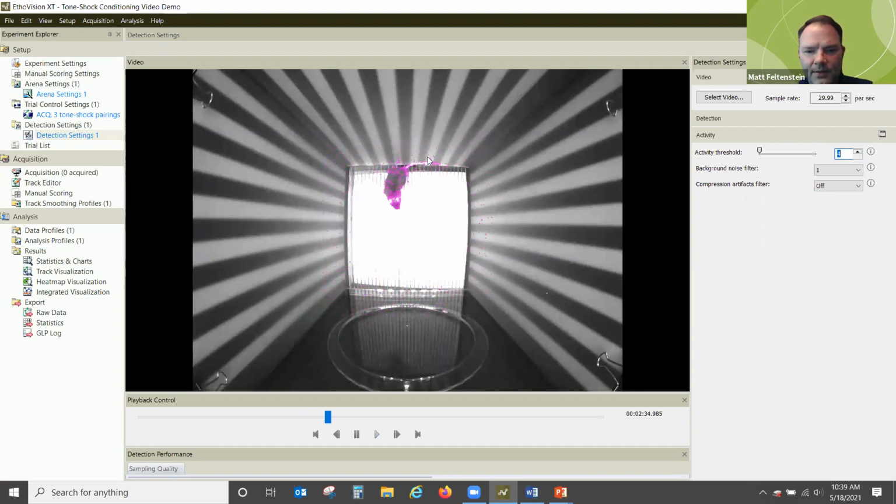I'm in the mindset that even without an animal in here, I see some purple pixel changes occurring, a little bit of background noise. The reason for that in my mindset is you want a little bit of background noise because if your animal completely freezes, if you have it set to no background noise, your threshold will be 0. So tell me when the animal freezes when it's 0% pixels or less. That's basically you bottomed yourself out. If you have a little bit of background noise, even if the animal freezes completely, even if they're dead and they're not moving at all, there's at least some % pixel changes. So we're kind of moving our floor up a little bit.